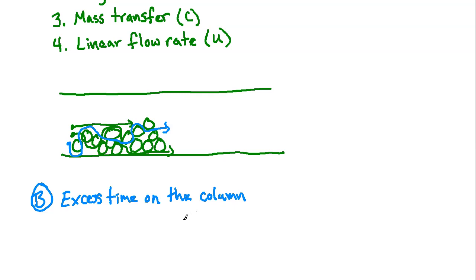So the more time that you allow a band of analyte to spend on the column, the more the longitudinal diffusion can take hold and start moving about. So unlike the multipath diffusion, which in theory, again, it's very theoretical, could drop to 0, the longitudinal diffusion may not drop to 0 because the very laws of thermodynamics and the way that concentration is going to spread with analyte particles would kind of be violated if you could somehow get this to 0.